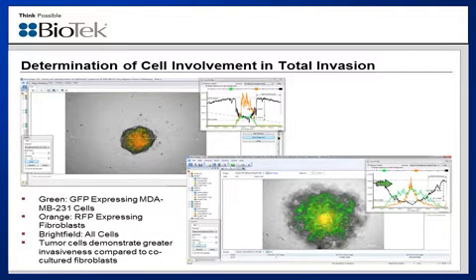On day 0, we can see the extent of the signal in micrometers covered by the GFP expressing breast cancer cells and RFP expressing fibroblasts matches up precisely to each other, as well as with the total area of the tumoroid, as we can see with the Brightfield signal.